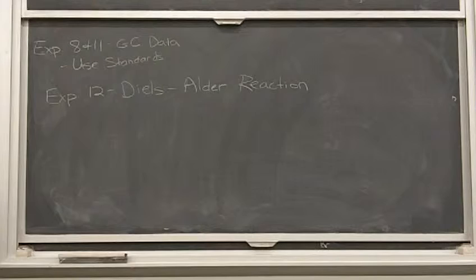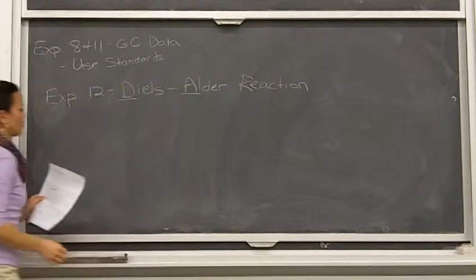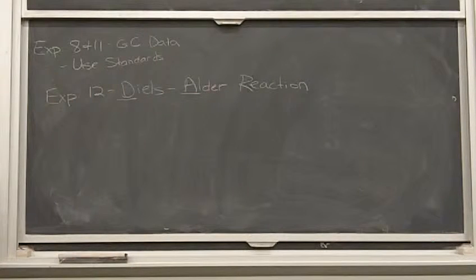And so just be careful when you go to write about Diels and Alder. D and A need to be capitalized. So hint there for the reports. Now with this reaction, it's a really fun, neat reaction if you set it up just right because it goes really well, okay?